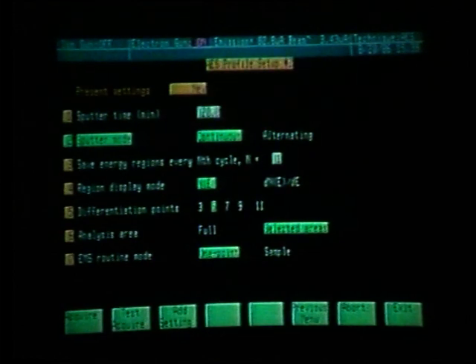Since we are going 20 sweeps on the silicon and several sweeps on carbon, and we have 5 elements that we are monitoring, for this particular analysis, it would probably be best to use the alternating sputtering mode.